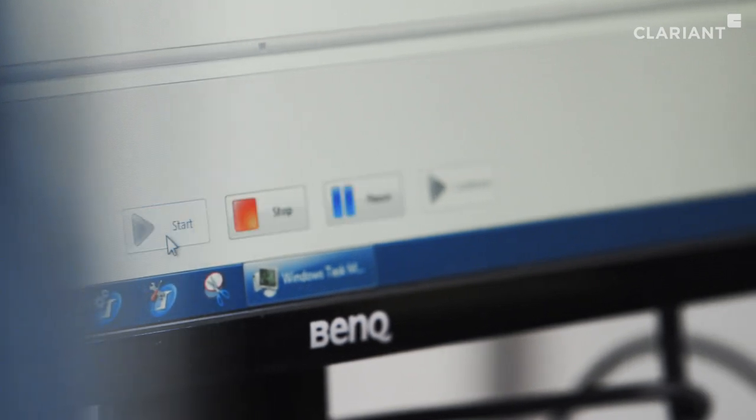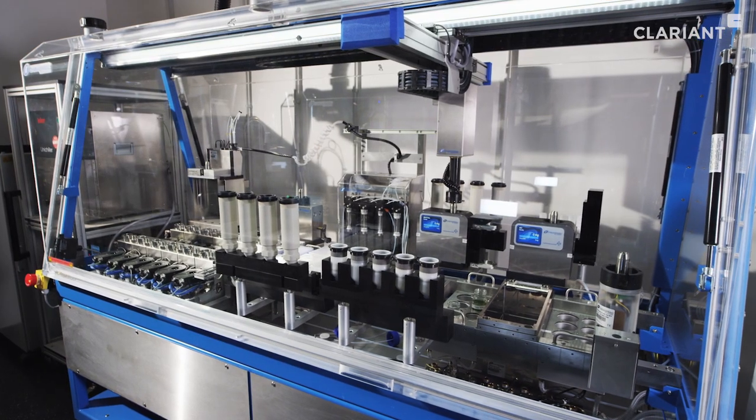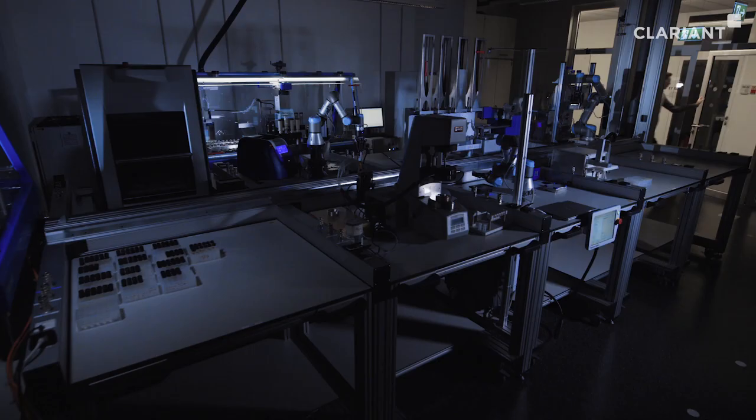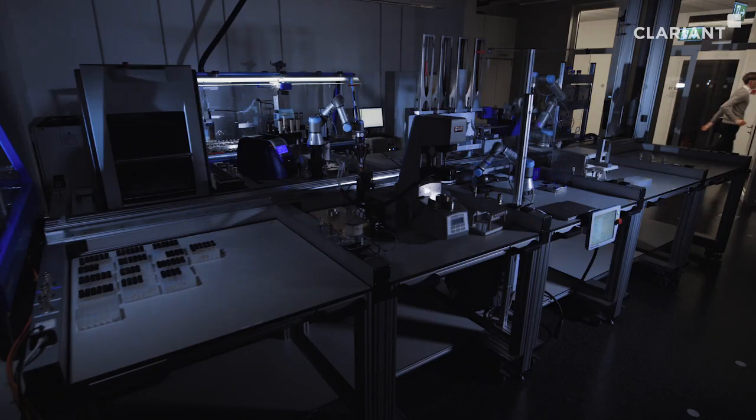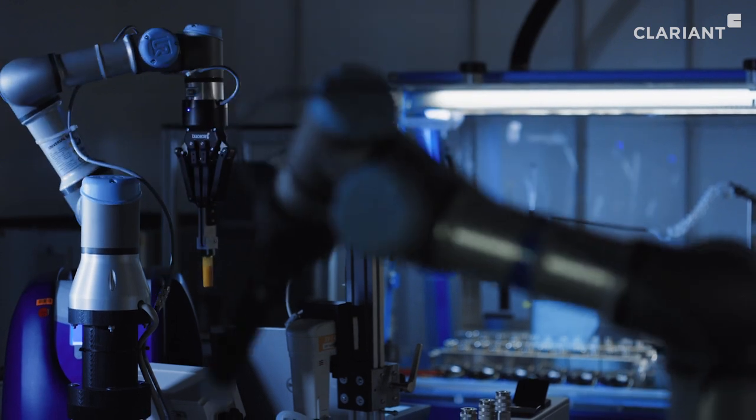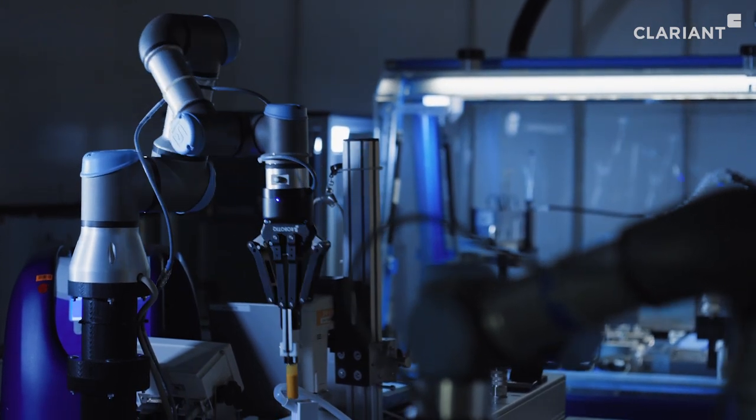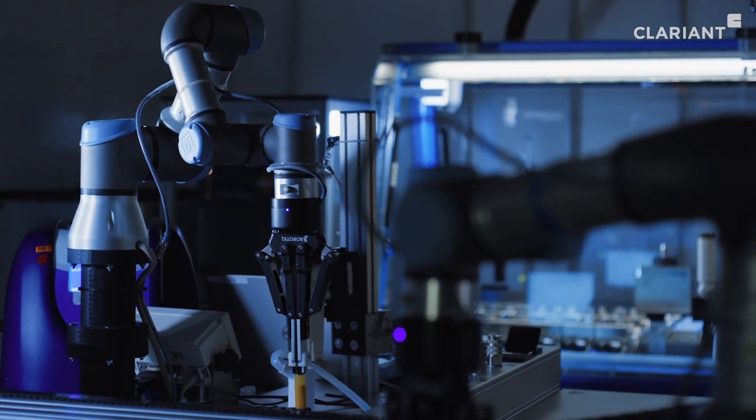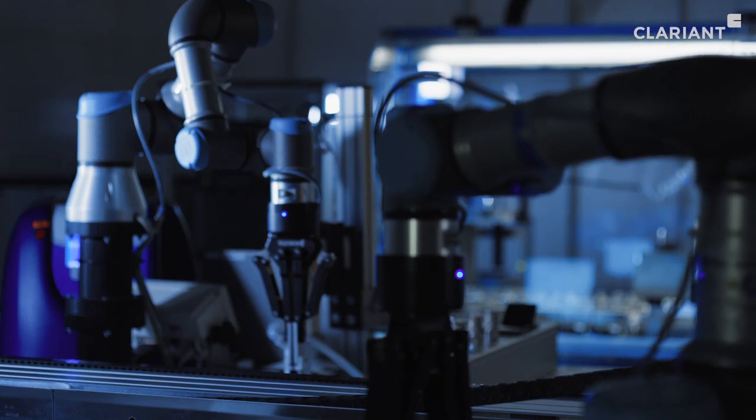Once the system is started, it runs an extended until completion. One big advantage of the automated approach is the 24-hour operation. An extension of the workday means an increase in throughput. Our lab keeps working so you don't have to.